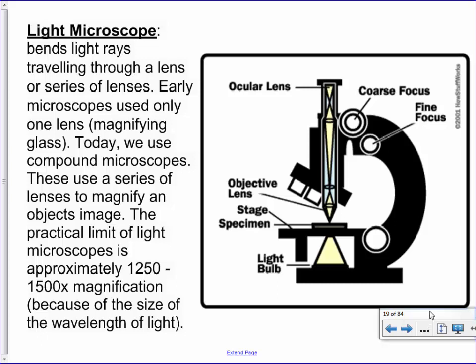I know. Okay, so here's a basic light microscope. Just like this one right here. I'll hold this one up and then we can talk about some basics of it. So, first rule of microscopes, don't drop it.